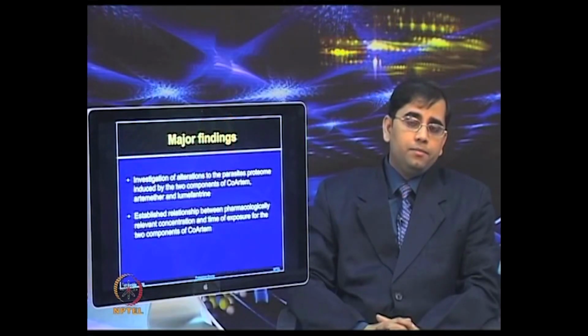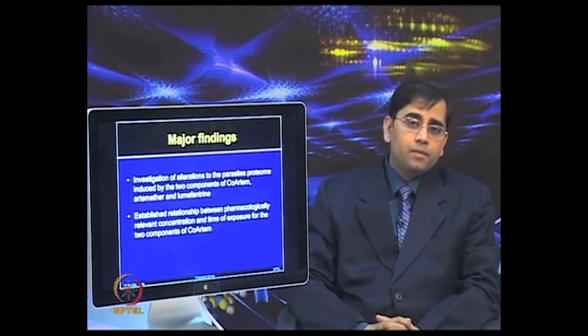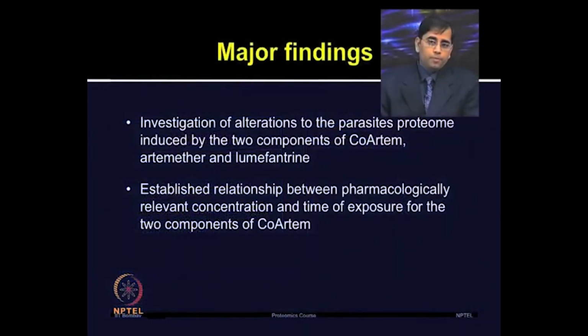From this study, the major findings were that the authors successfully investigated alterations of the parasite proteome induced by two components of Coartem, artemether and lumefantrine. By using a proteomic approach, they investigated specific and non-specific effects of two anti-malarial drugs in pharmacologically relevant conditions.